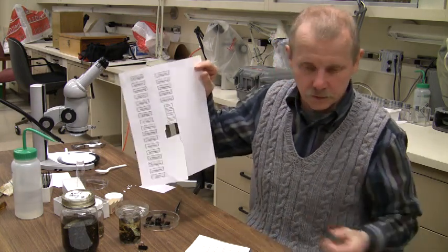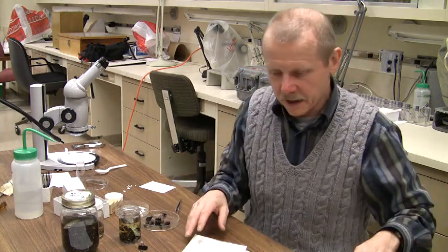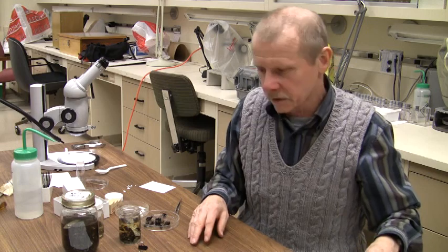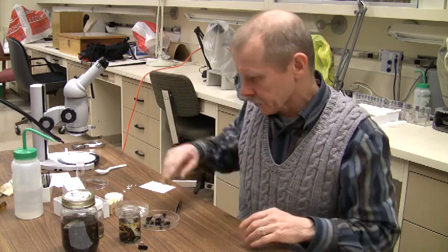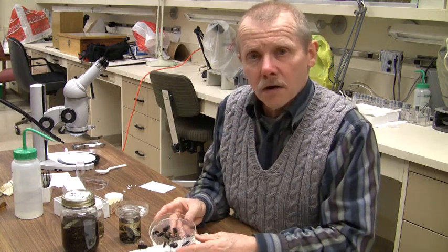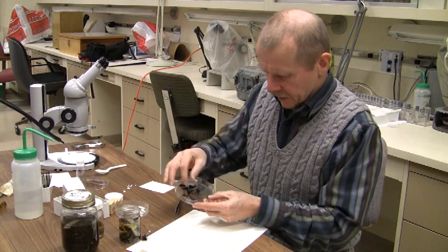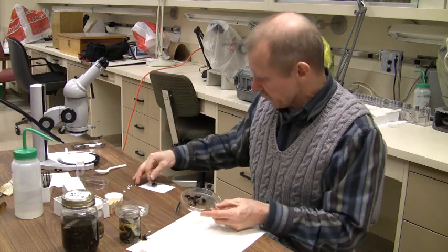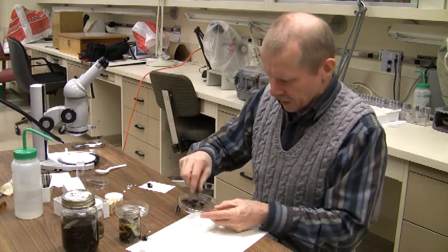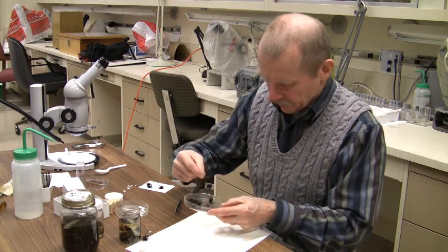For now, we don't need to worry about those. What we're really trying to do is prepare the specimens, and after we get them prepared and identified, then we can worry about organizing the collection. What I've done here is taken some insects from the coarse fraction — the larger insects — and laid them out on a piece of paper to dry a little bit. We have some bees, some wasps, and some other things as well.